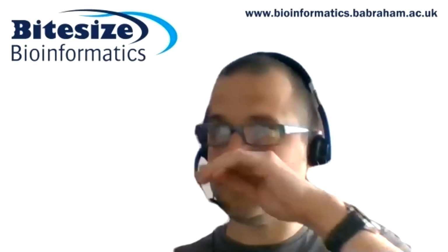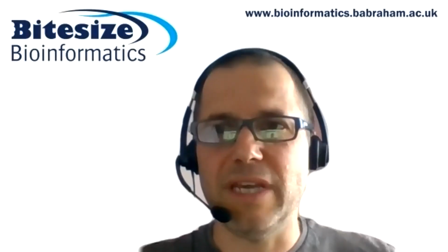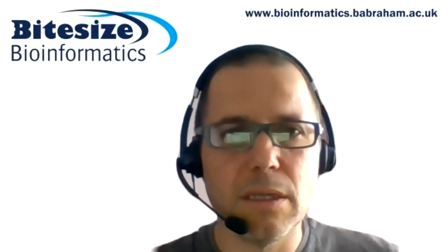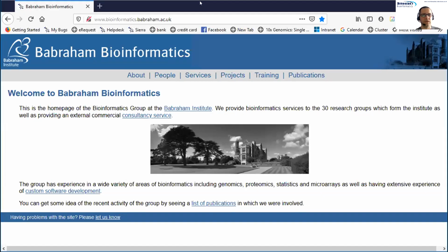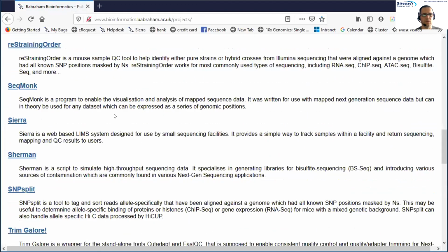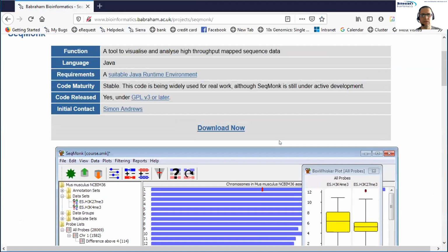Let's start with some basics then about how do you get the program, set it up, and get it working. I'm going to switch across to sharing my screen then. So here I'm showing just a view of my group's web pages. Inside here, under projects, we have all of our different software projects that we distribute, and SeqMonk is under there. So you can see the page for that and the download link.